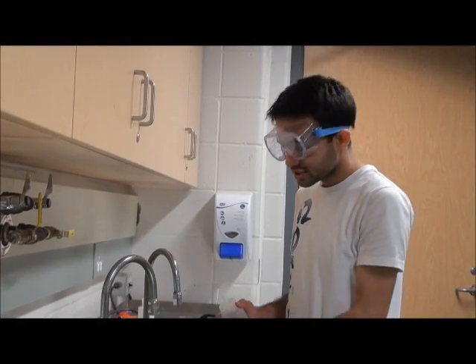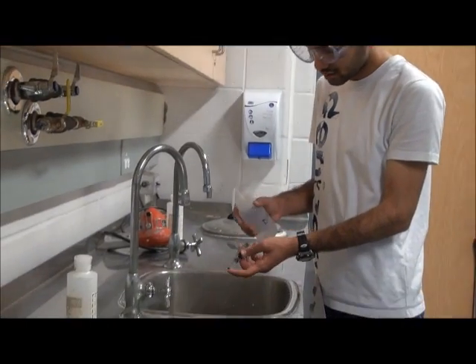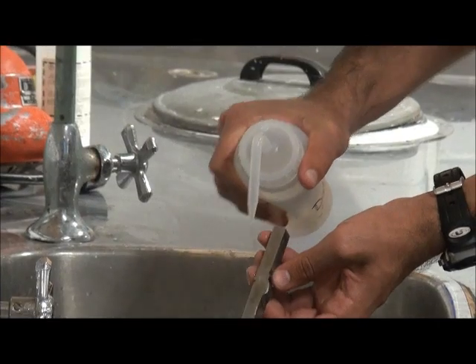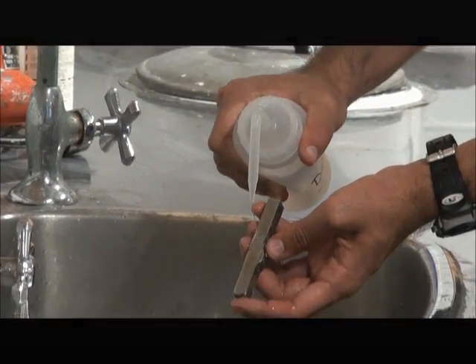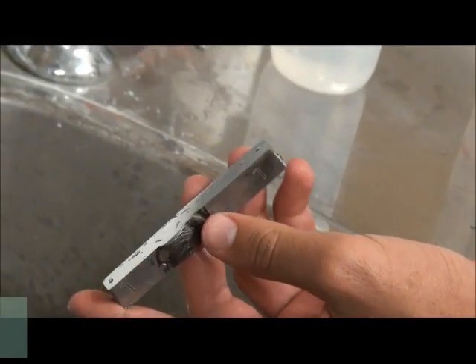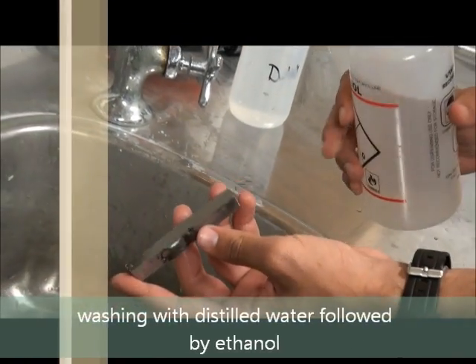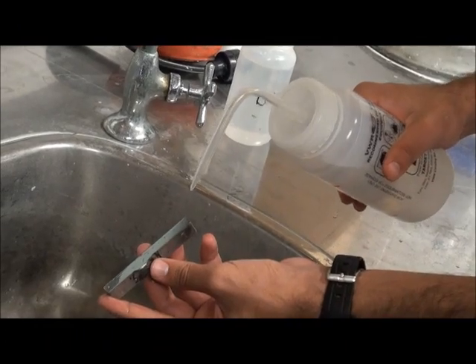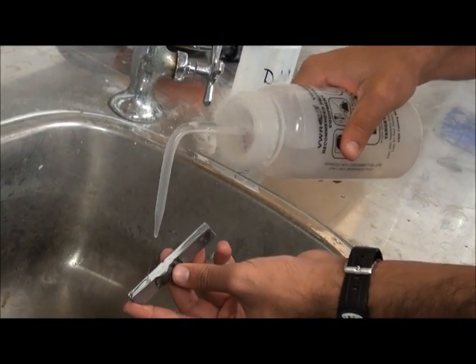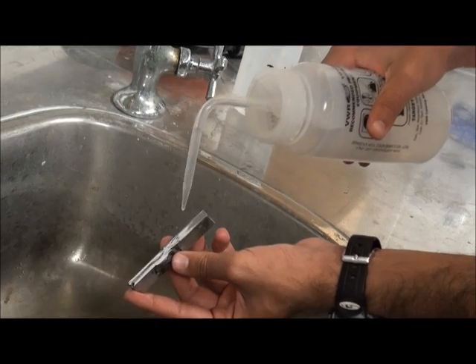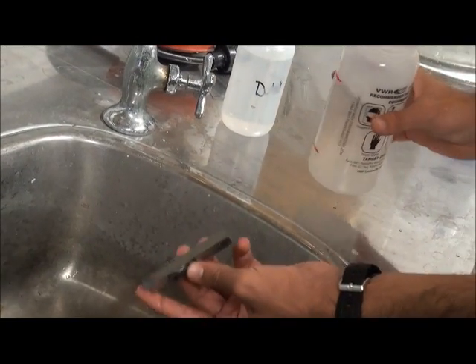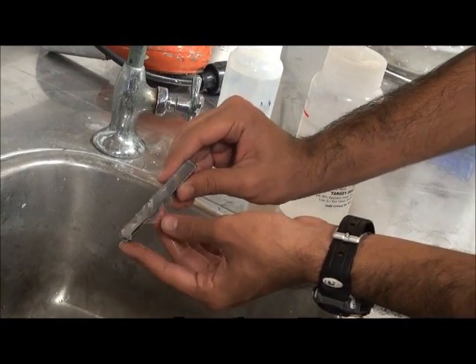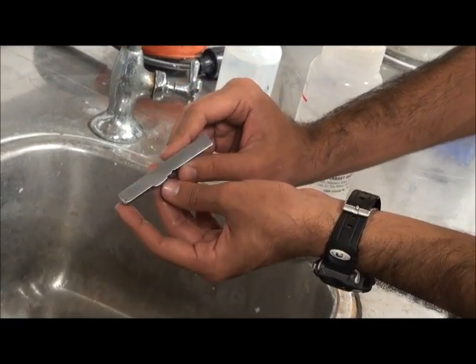After polishing, I am going to wash the sample with distilled water. We have to use the ethanol to remove the excess water on it. As you can see, the surface of the sample has become as clear as a mirror.